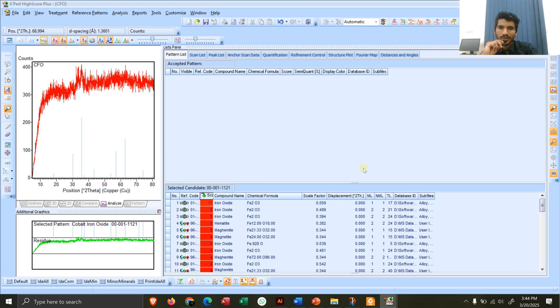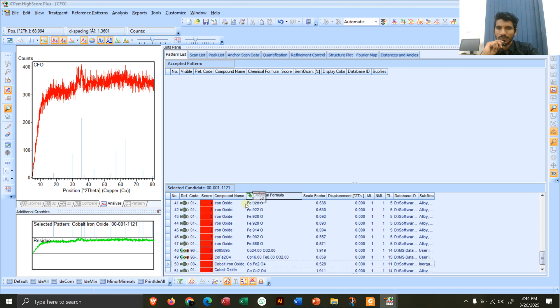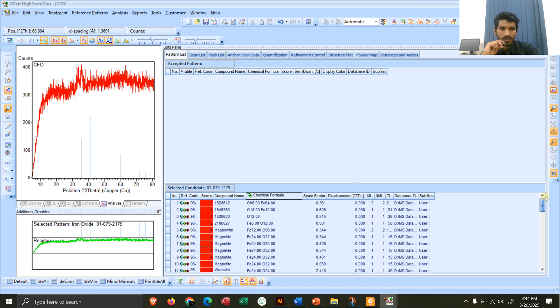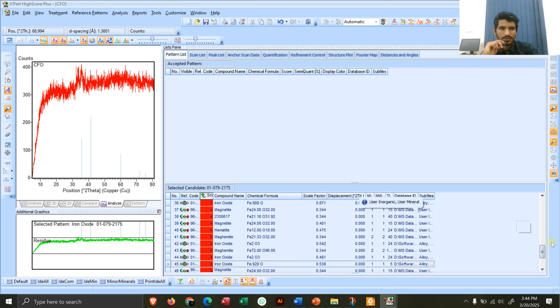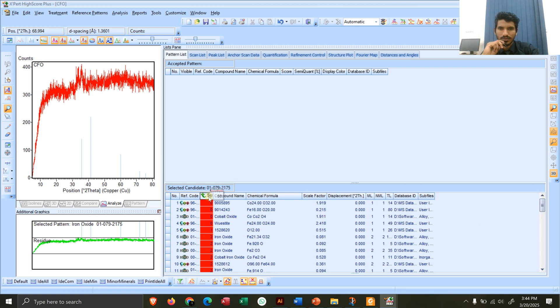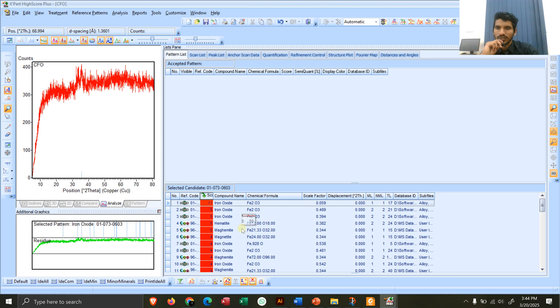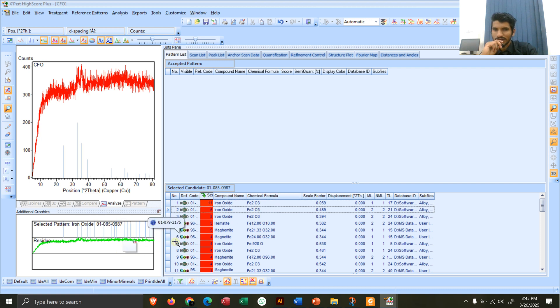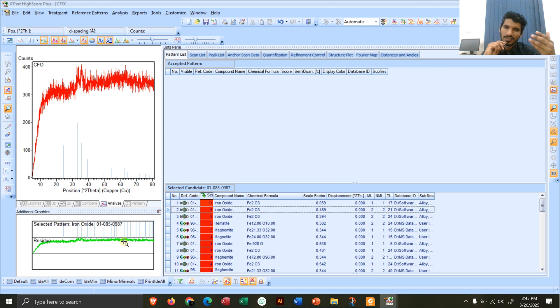After performing that search, you can see there is a match with Fe2O3, meaning iron oxide has formed. Rearranging the results, you can see iron oxide peaks — some are not very visible but others are clearly visible. Selecting the second pattern, several peaks become visible and match the reference positions. This means our compound contains two phases: cobalt iron oxide as well as Fe2O3 (iron oxide).